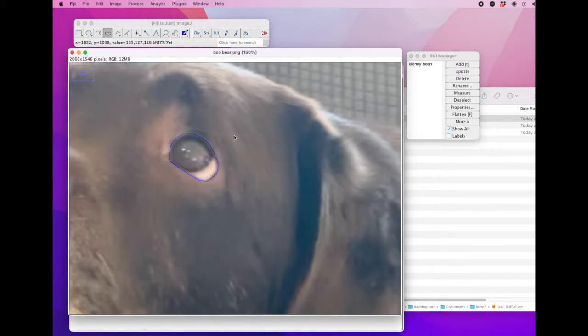So there you go. Okay, and another option for those who don't like tracing by freehand is to use the connected polygon tool, right? So this tool, first of all, let's click this to hide the initial drawing. So this polygon tool allows you to draw, click, right, click, and draw segments of lines that are connected, right?